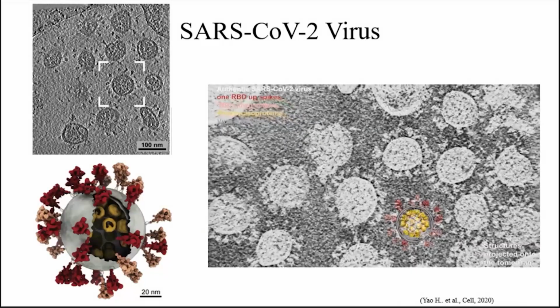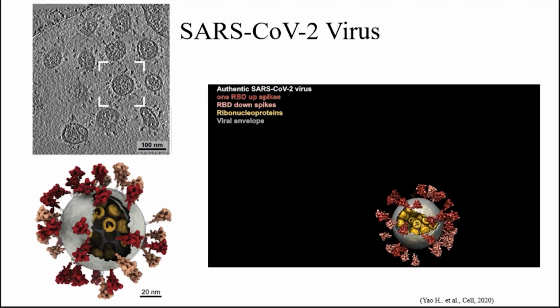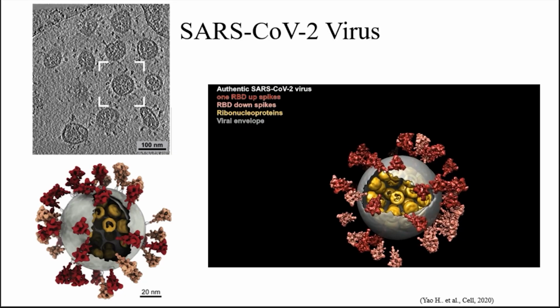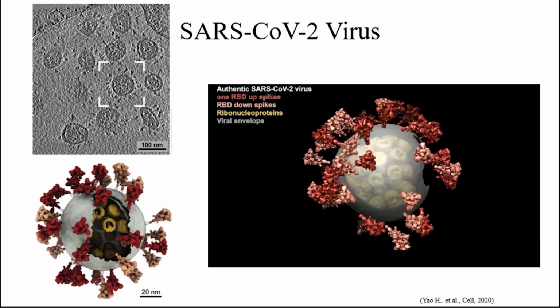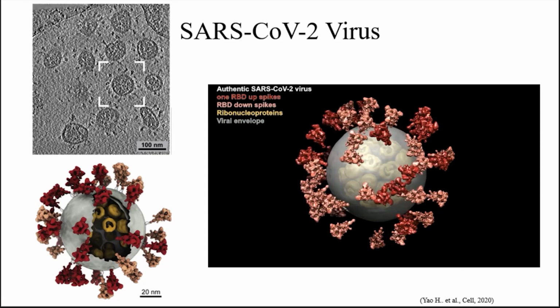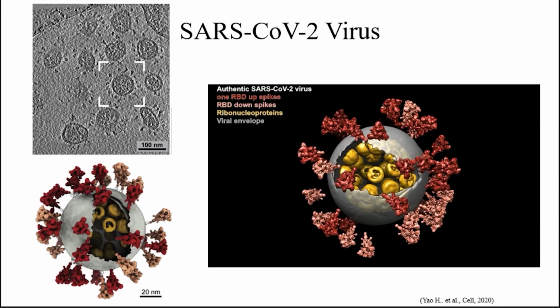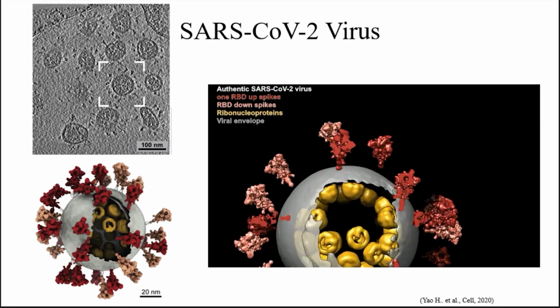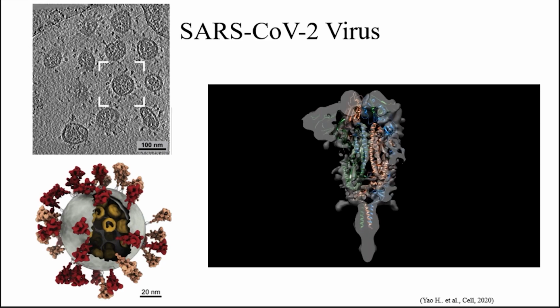And look at the scale, it's all in nanometers. So you are looking at something so small using an electron microscope. Each protein, you can get the detail of it, what is happening. That much you can zoom in and get the information, right?